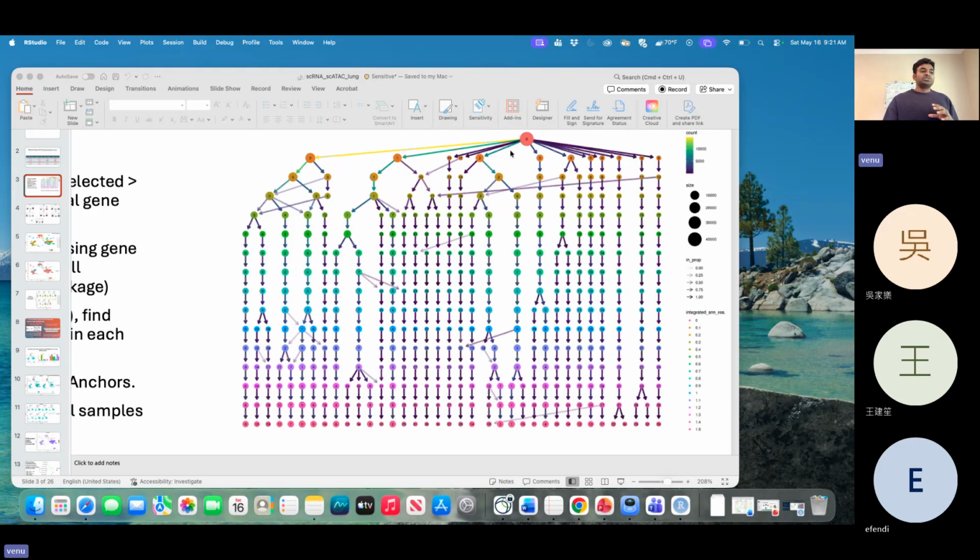So it observes these top spots. Then again it takes this top spot and runs within the spot again. It splits into two cell types, because it sees there are different markers. So these 100 are expressed differently from these 100. Based on that it forms a tree. It keeps splitting until it comes to a constant level, from 0.